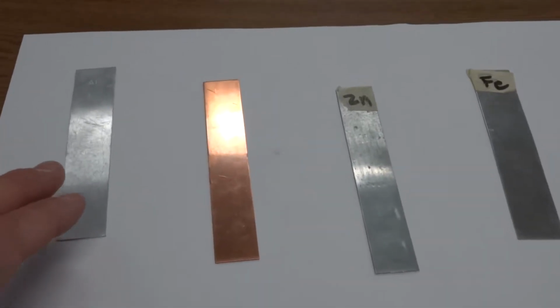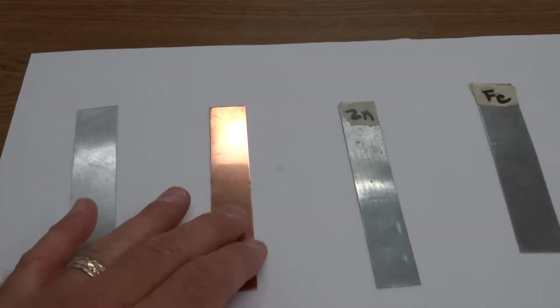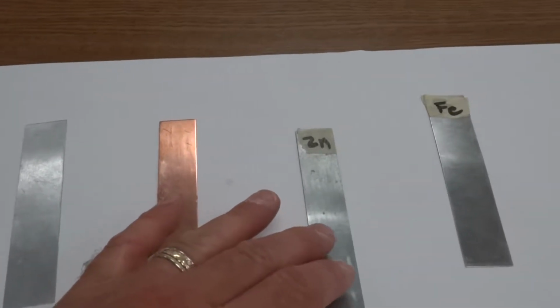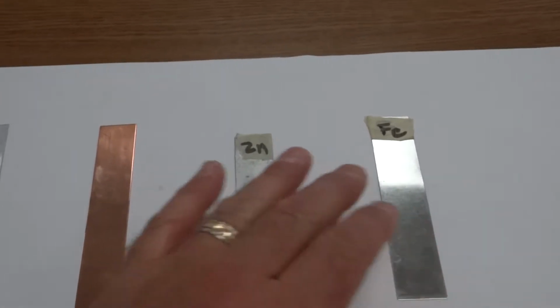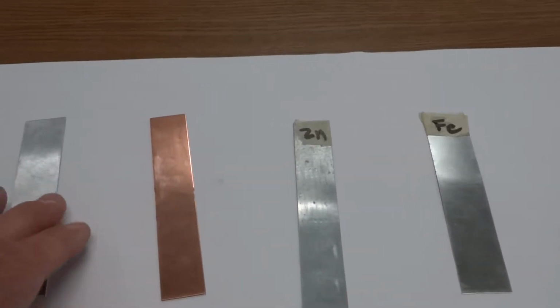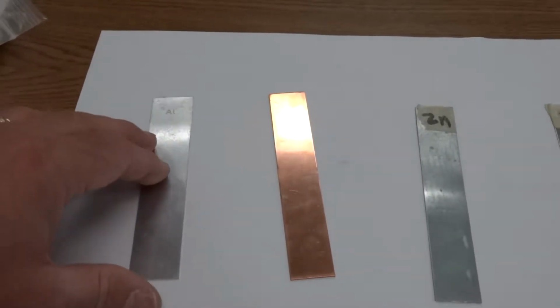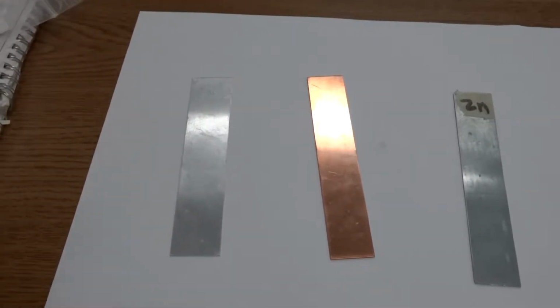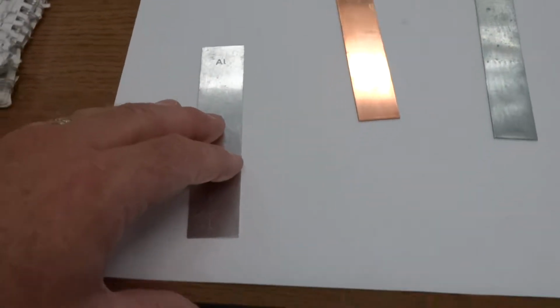Okay, so we have four metals in front of us. We have aluminum here, Al, copper, Cu, zinc, Zn, and iron, Fe. Those are the chemical symbols for each item. So what I'm going to try to do here is the malleability test. And malleability means the ability to roll or flex the metal.